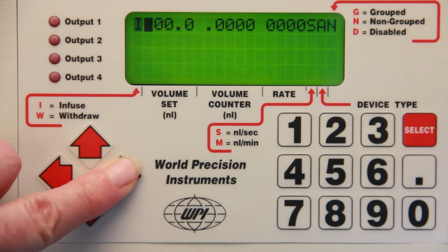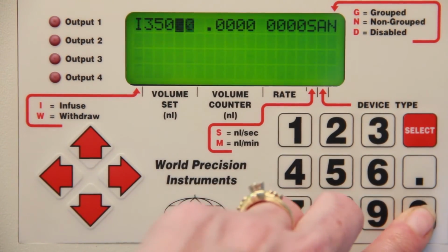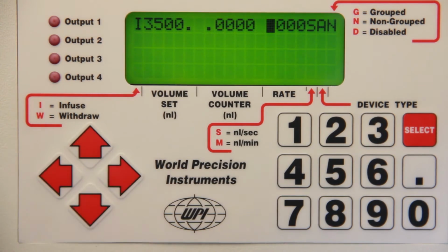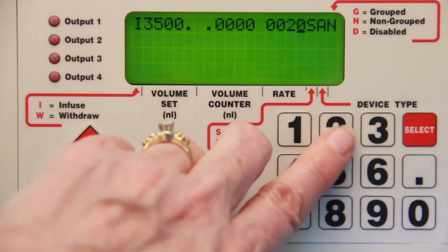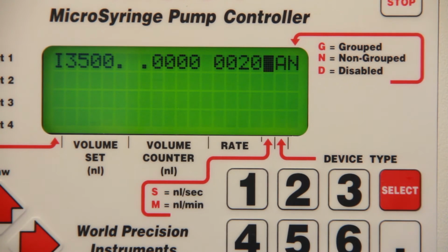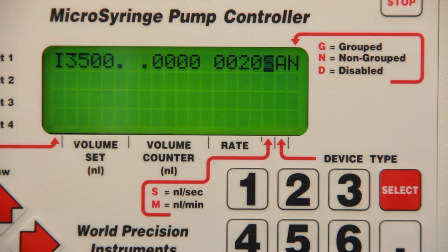Now move the cursor over the next set of numbers and set the total volume in nanoliters to be dispensed. The next set of numbers on the display shows the volume in nanoliters which has been dispensed. To set the rate of infusion, move the cursor to the rate column and enter the desired amount. This number represents either nanoliters per second or nanoliters per minute, depending on the settings of this character. Use the Select button to toggle the setting you want.